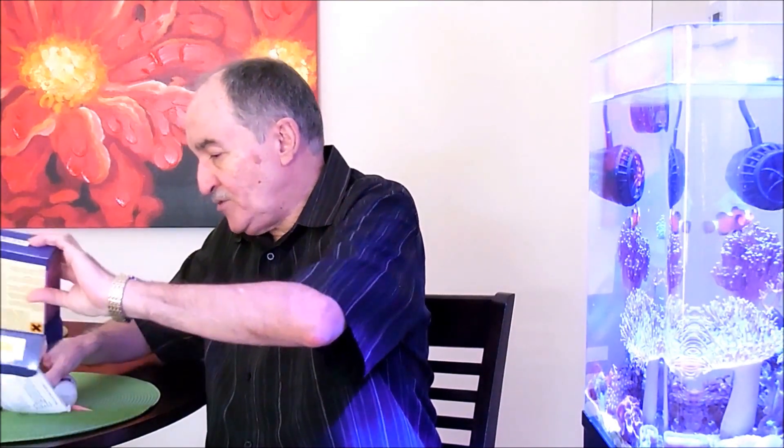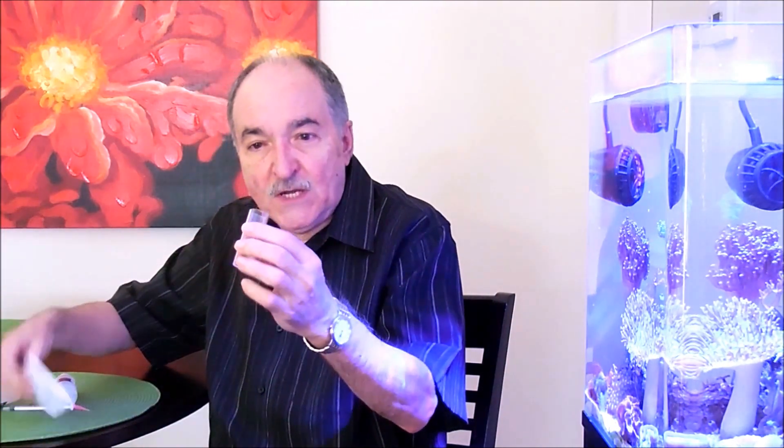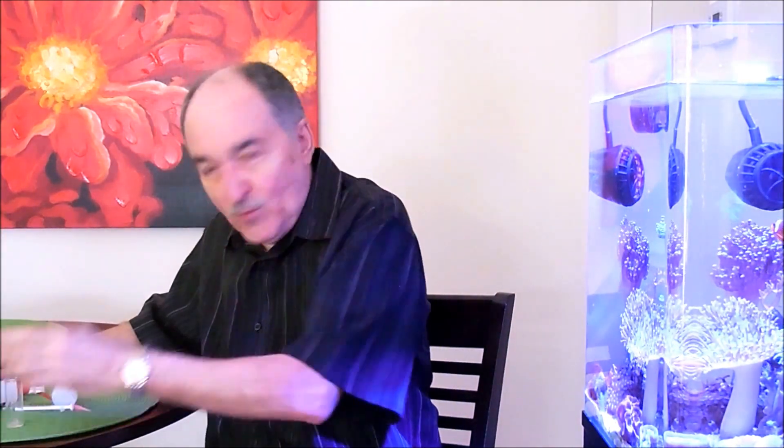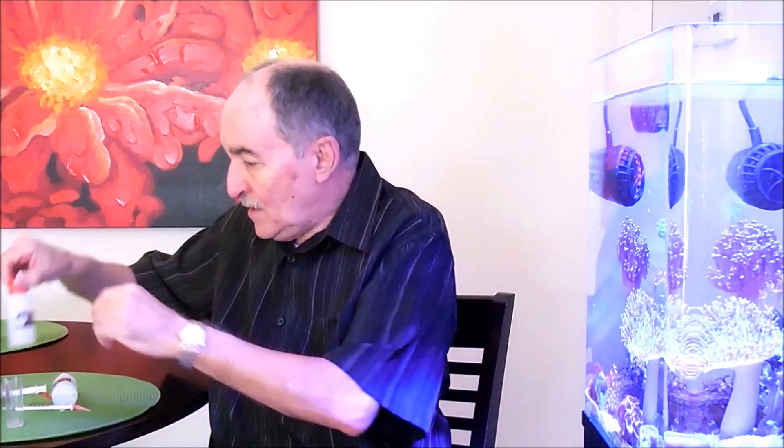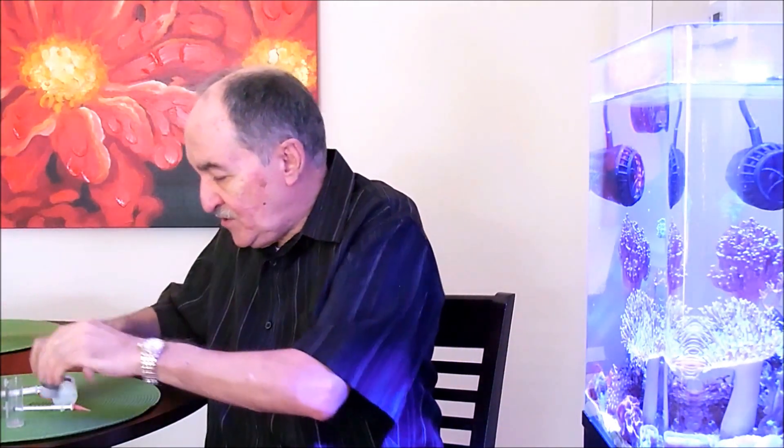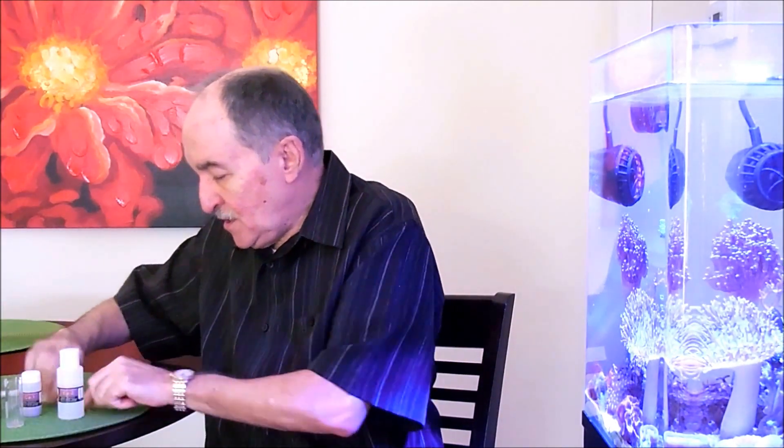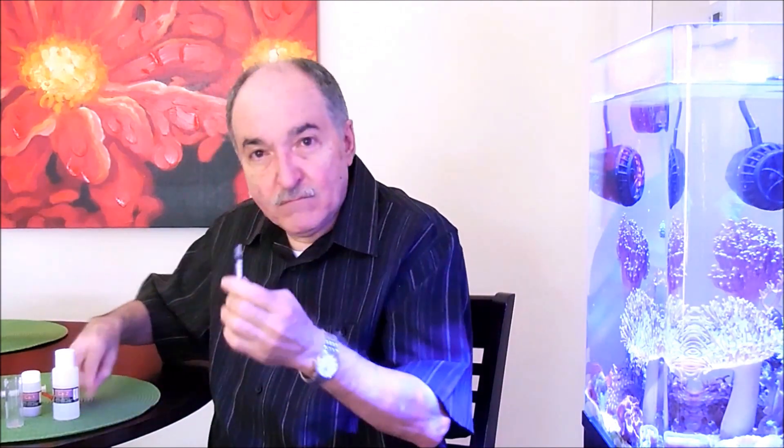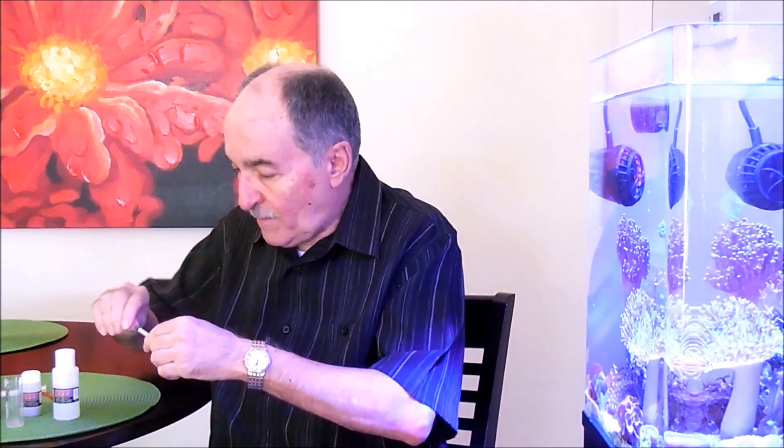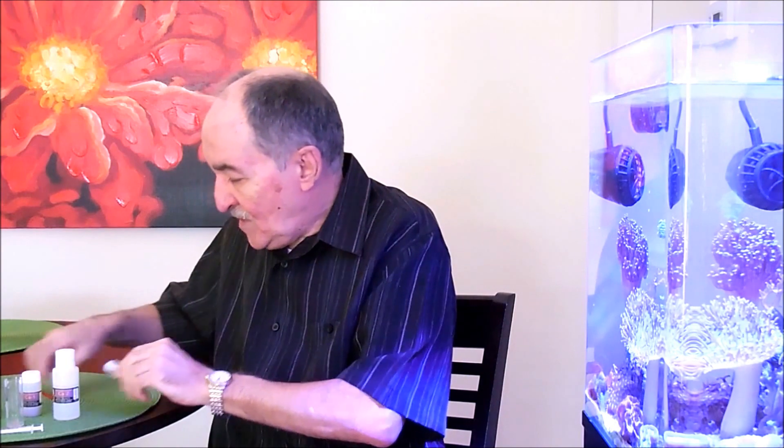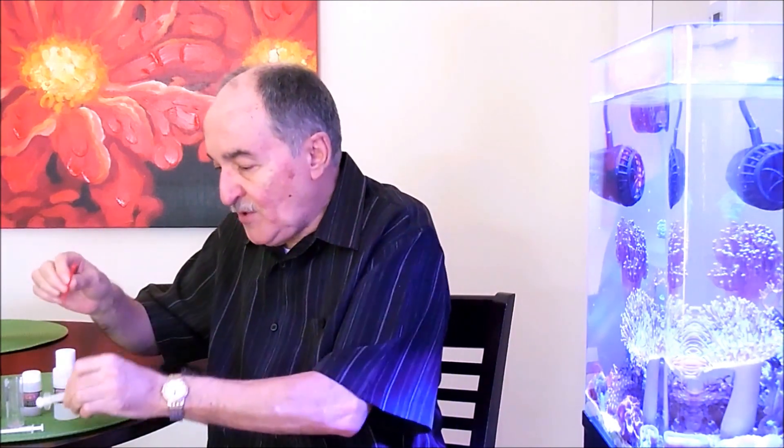Let me open the package and you'll see what's included here. This is the test tube where we put the different liquids that we're going to be using, powders, the 1ml needle, the applicator, and the other needle to extract the water from the tank. And here are the instructions.